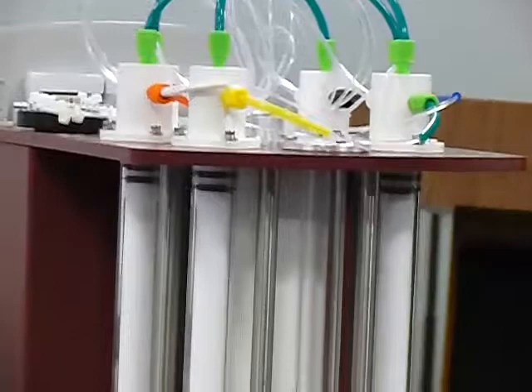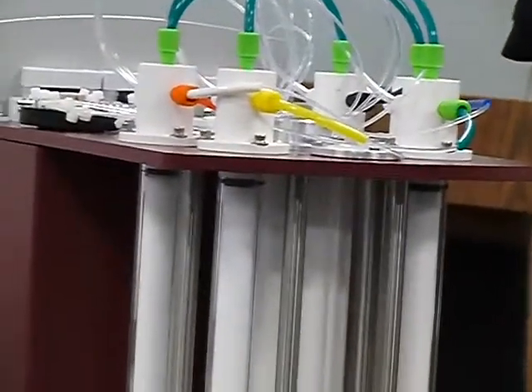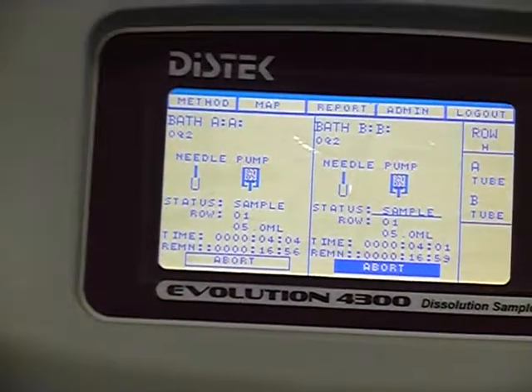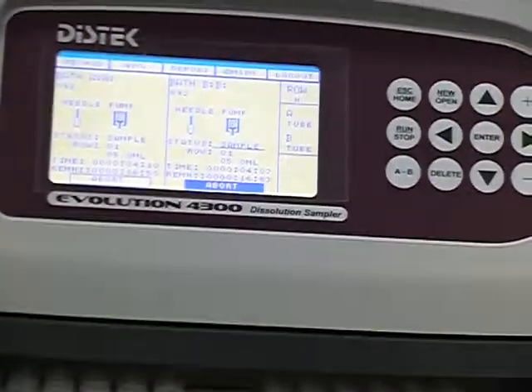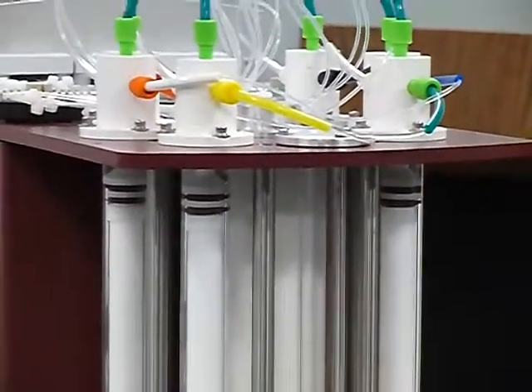But the slower they want to run, then they've got to allow more time. It needs more time, because then it knows itself it's going to have a conflict, and it's not going to allow you. It won't even allow you to create that method. It'll tell you time conflict, time adjustment. So it adjusted its times for you. But you've got to go back in there and look and see what it did. Your 15 minute now is 16 minute. Your 5 minute pull you wanted, 5 minute, now moved it to 4, because it needed to open that window up. Or it might have made it 6 or 7 minutes, and it's bumped everything out.